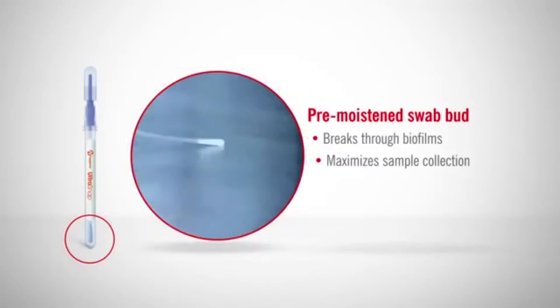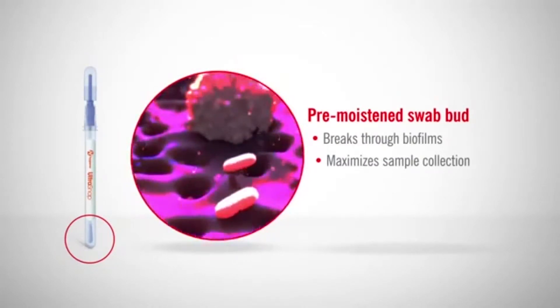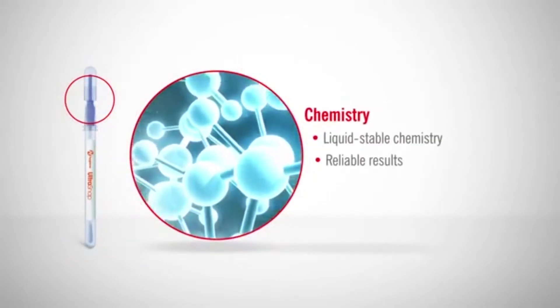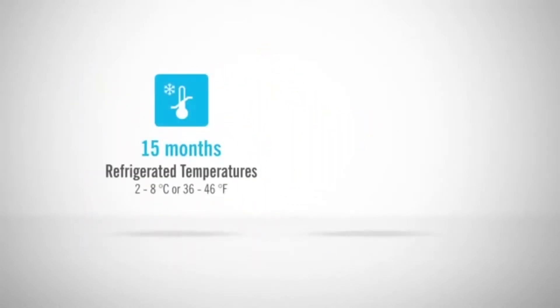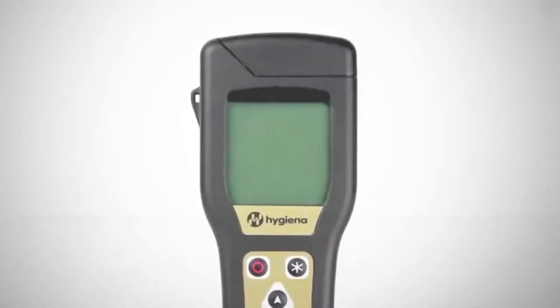UltraSnap's pre-moistened swab bud breaks through biofilms and ensures maximum sample collection for accurate results. The liquid-stable chemistry and Hygiena's patented SNAP valve facilitates superior sensitivity and reliable results. UltraSnap has a shelf life of 15 months at refrigerated temperatures and 4 weeks at room temperature.